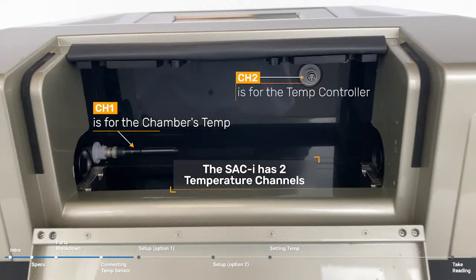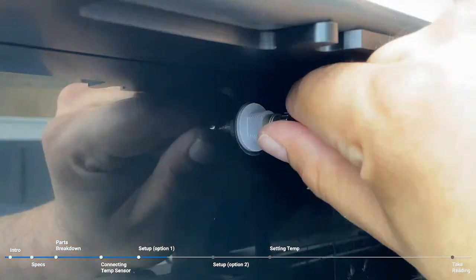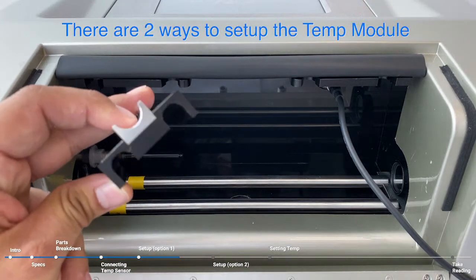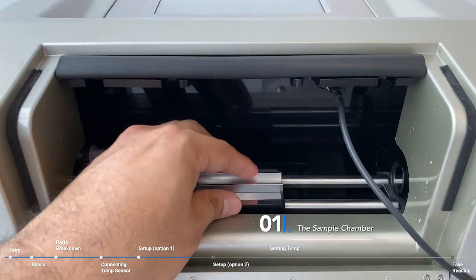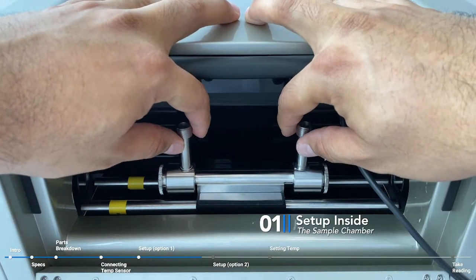Okay, the SAC-i has two temperature channels. One is for the temperature chamber, the other one is for the temperature controller. So hook it up at the back to the temperature controller. There's two ways to set up. You can set it up in there, or you can set it up outside. So right now we're showing you how to set it up in there. You put the base on, then you put the flow cell.